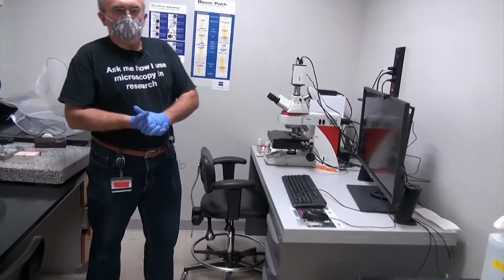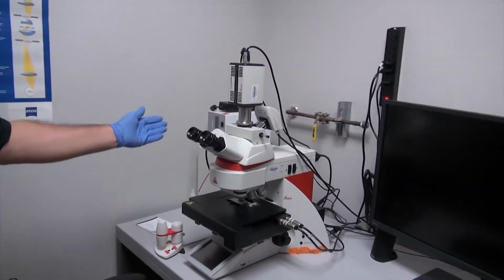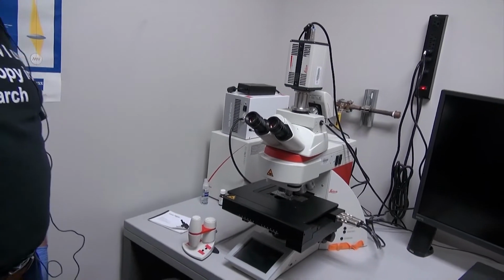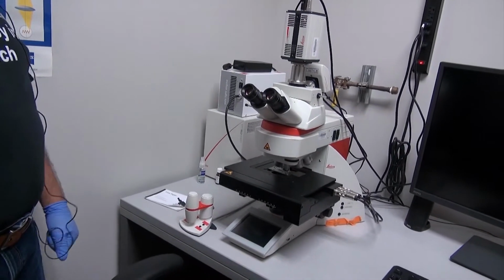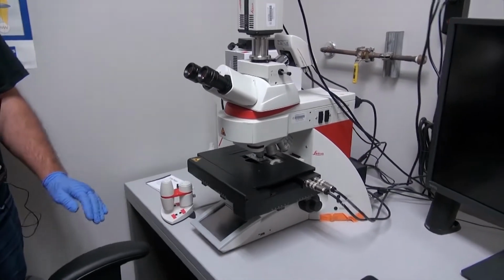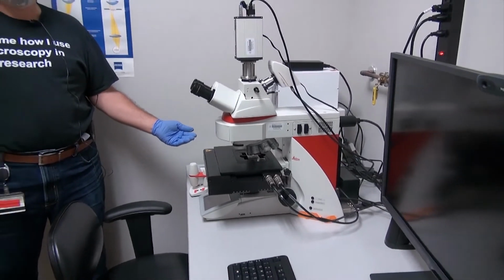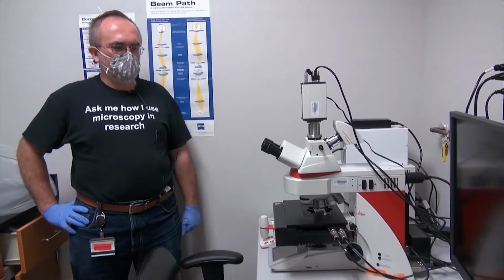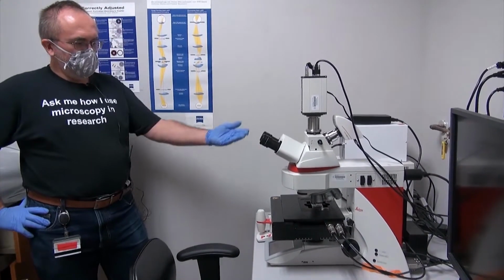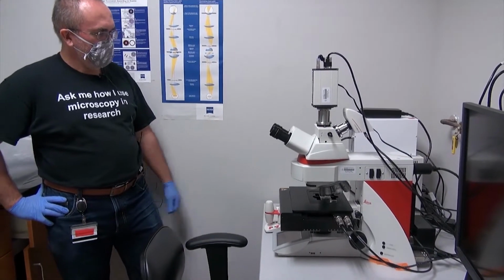Now, if you don't need a confocal microscope, then there is this upright fluorescent microscope, the Leica DM6B. This microscope has a motorized stage, so again it allows image stitching, which is very handy for very large tissue sections on a slide. They can be imaged at a high resolution, or essentially the whole slide can be imaged and the images stitched together.